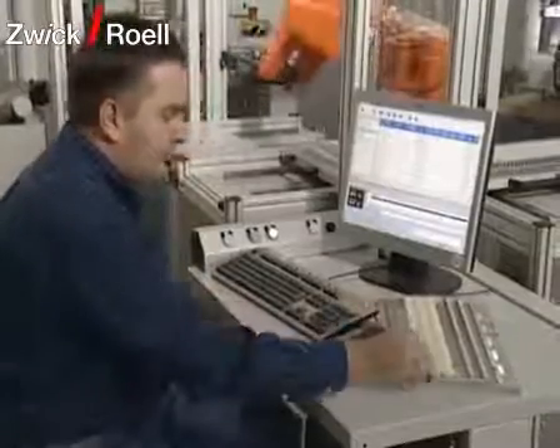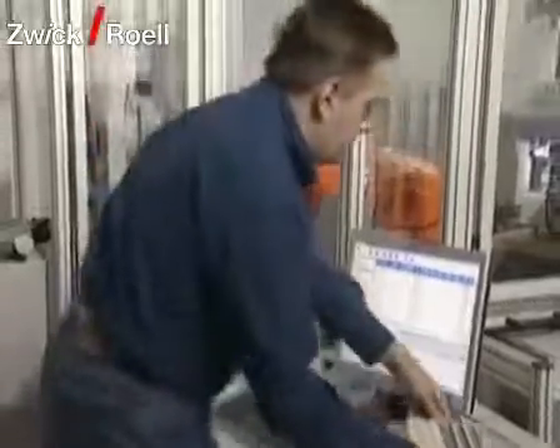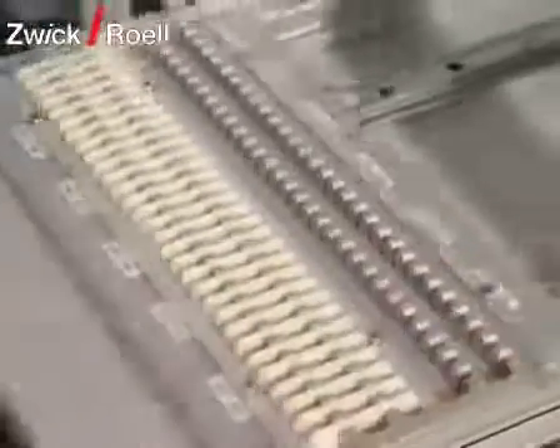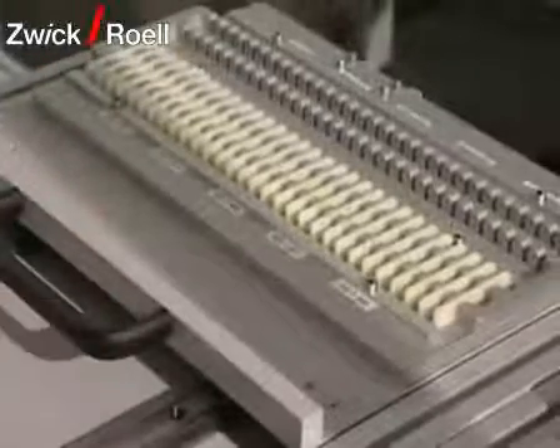The specimen magazine is variable and can be adjusted to suit the requirements of the customer. The magazine in this machine offers space for a total of 180 specimens.